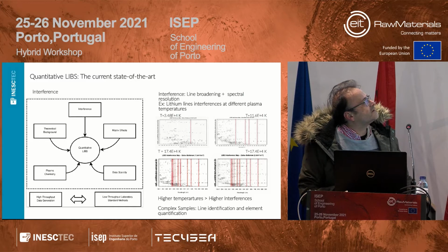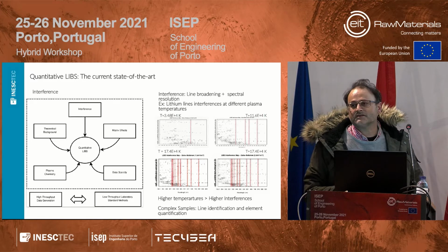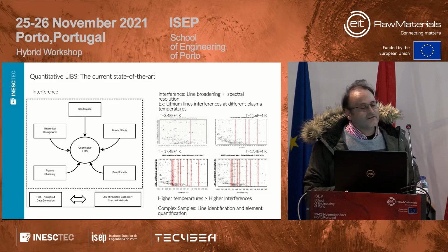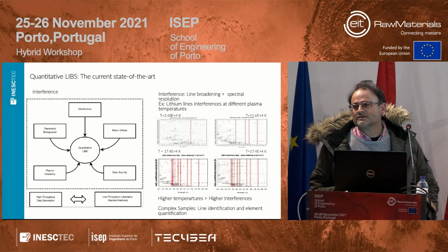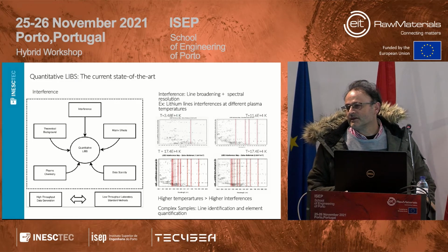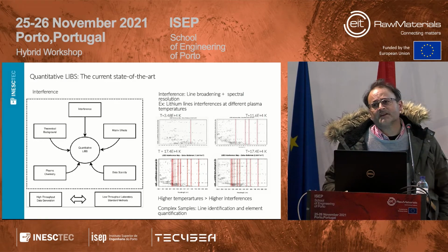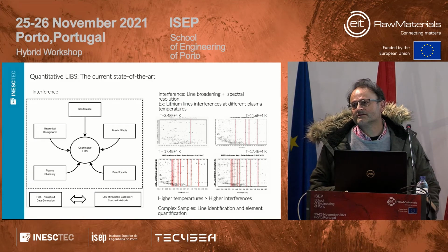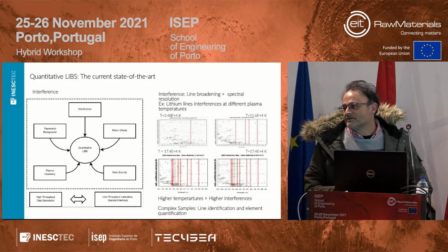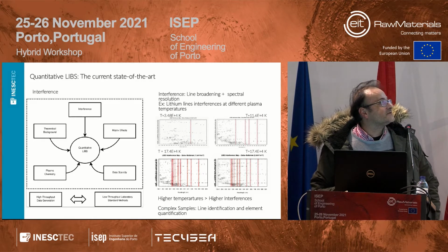So after these examples, I would like to go through some of the main difficulties of processing LIBS spectra. One of the most important ones is that we cannot assume that each line that we observe in the LIBS spectra belongs to a single element. This is because there is a thing that is called interference. This means that lines that are very proximal are seen in the same pixel of the CCD, or in a very nearby pixel of the CCD. This is CCD.